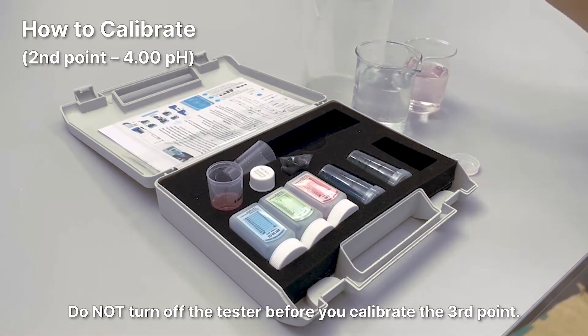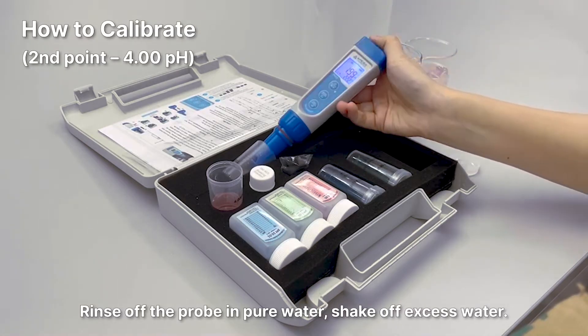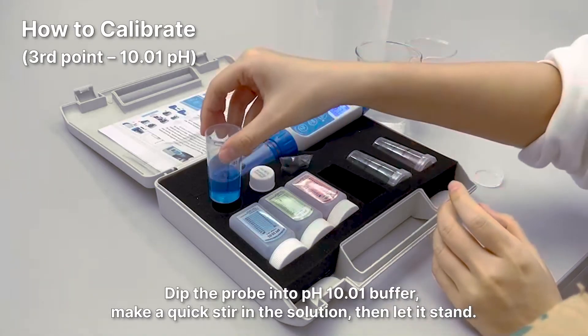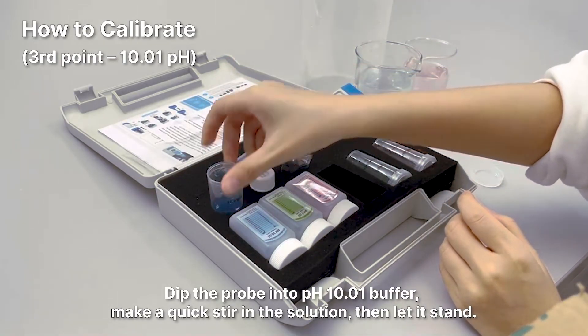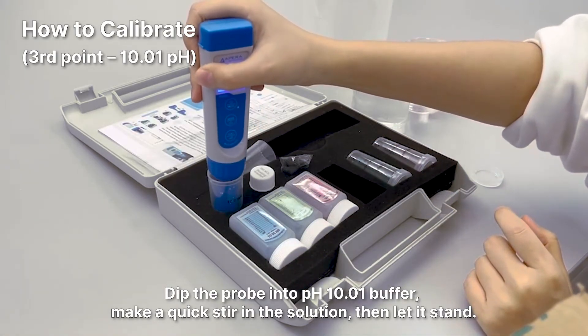Do not turn off the tester before you calibrate the third point. Rinse off the probe in pure water and shake off excess water. To start the third point calibration, dip the probe in the pH 10.01 buffer, make a quick stir in the solution, then let it stand.